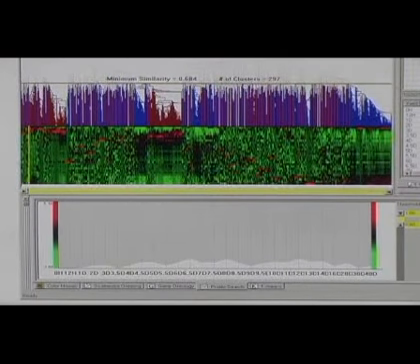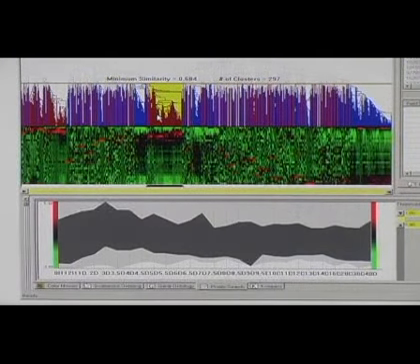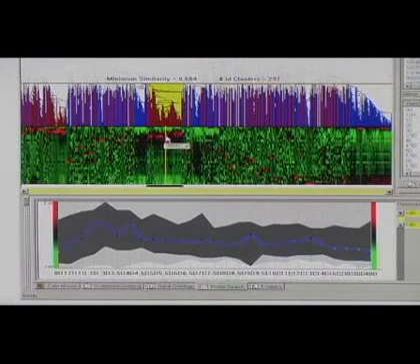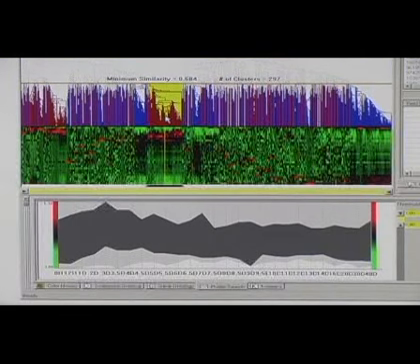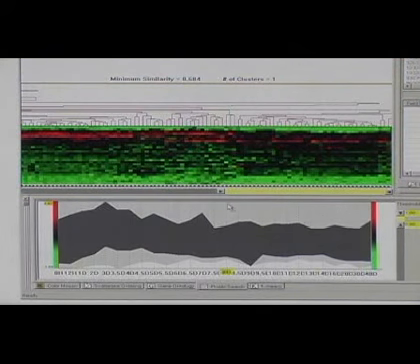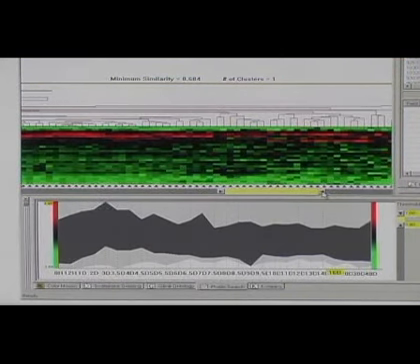In addition to the scatter plot views shown earlier, HCE has another view called Profile Search. If you click on a cluster, you can see the time-varying patterns of the genes in the cluster in this view. This view is especially useful for time series data like this dataset. You can zoom in a cluster by right-clicking on it and choosing Show Only This. You can zoom in further by adjusting this double-sided slider bar. Again, use the minimum similarity bar to get more delicate cluster separations.